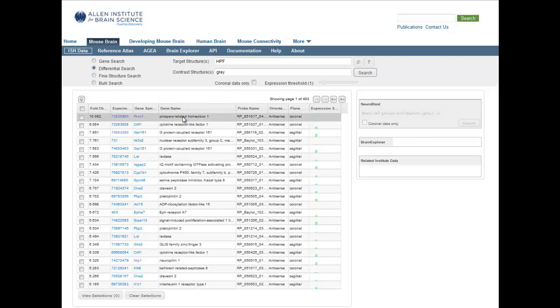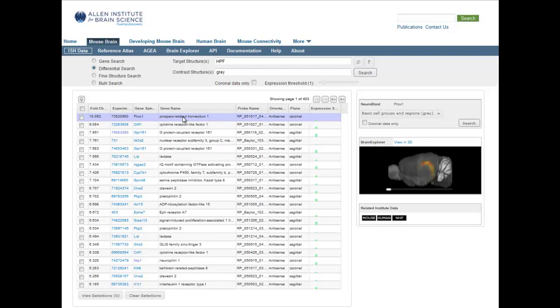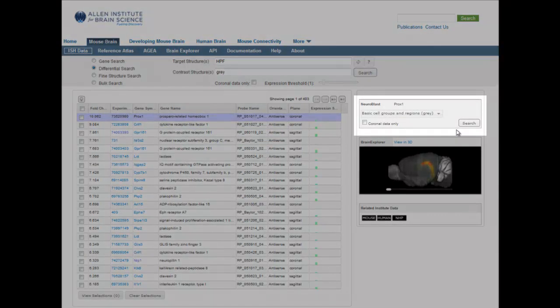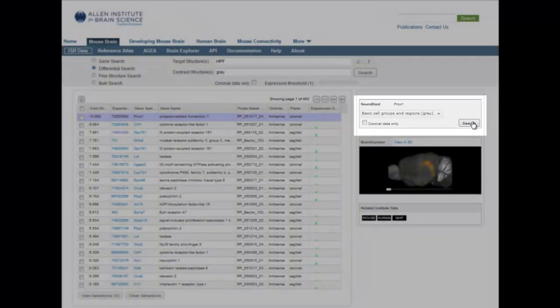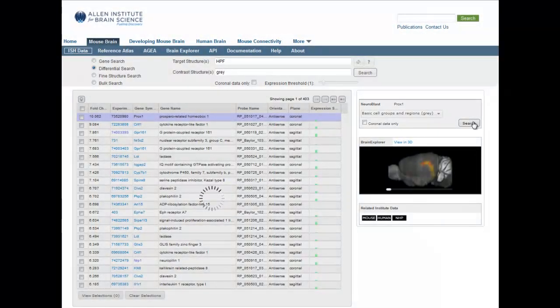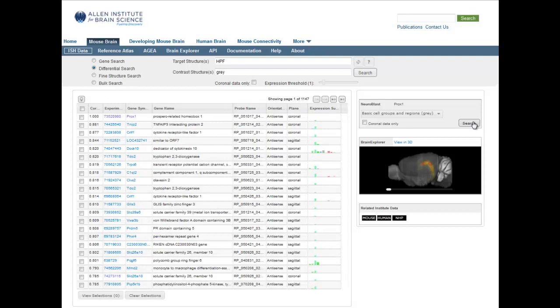Once you have found a gene of interest, you may want to find other genes with similar expression patterns. This is accomplished using the Neuroblast search. Once a gene has been selected, clicking Search will return a list of genes matching your selection criteria with similar expression profiles as your gene of interest.